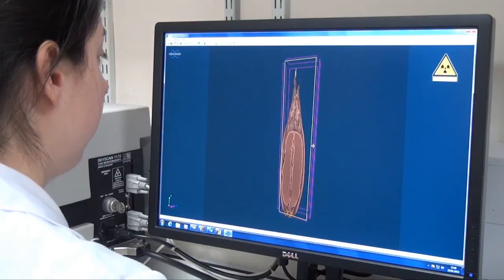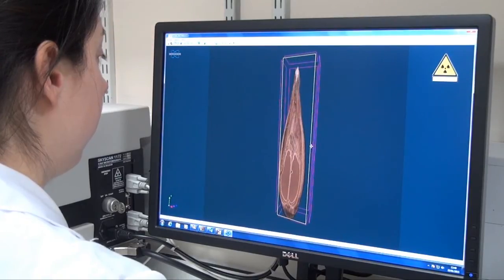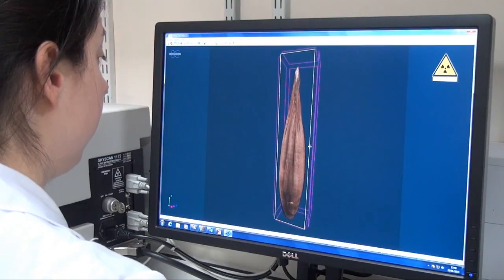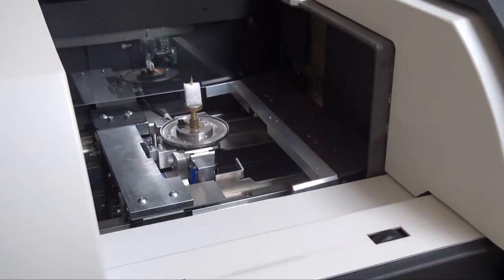The detail revealed in small samples, such as this oat grain, illustrates the potential for raw material characterization and identification.